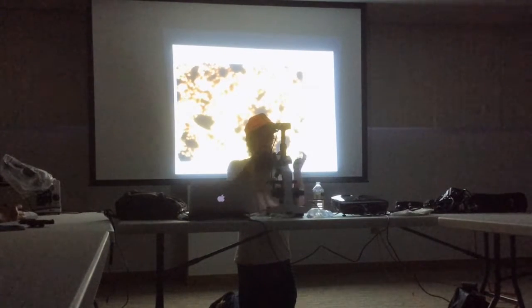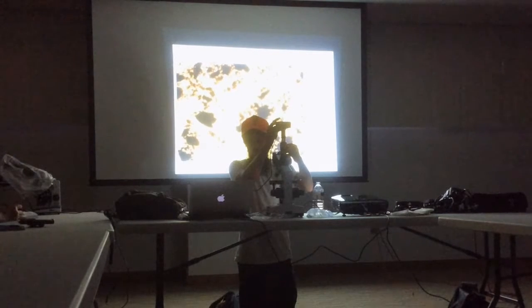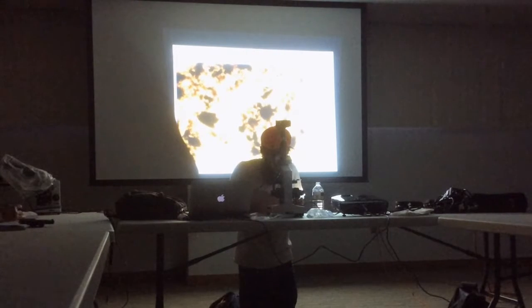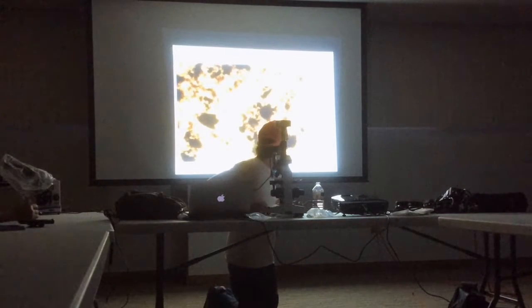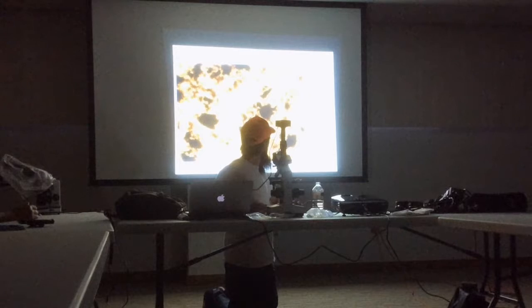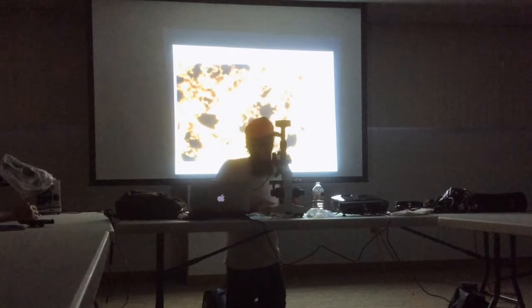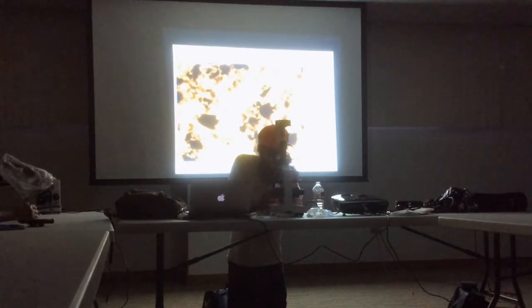So, let me see. What magnification do you have right now? What power are you on? Right now, I'm looking at it at 100 times. Okay. So this sample is pretty dirty. It didn't aggregate very well. I was looking for some nematodes, but I found this right here.